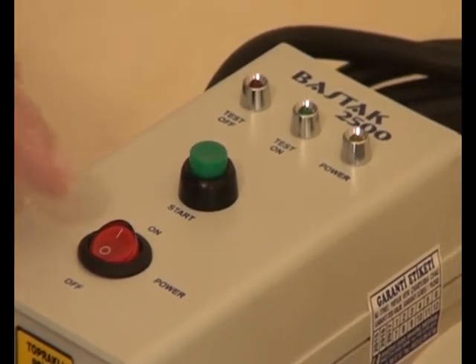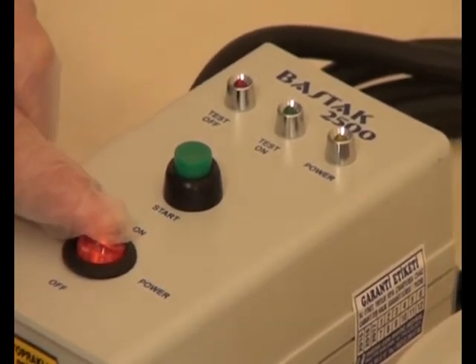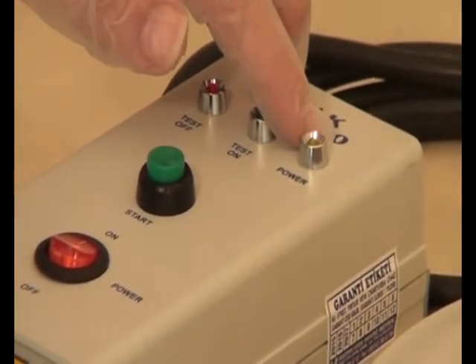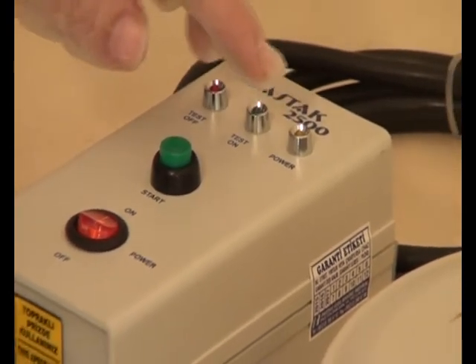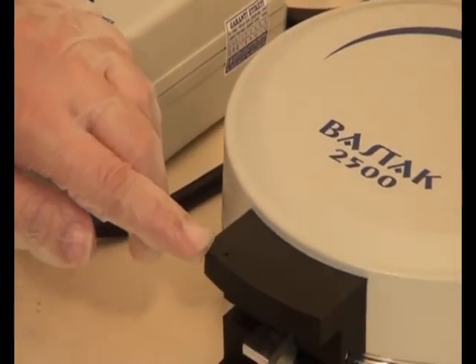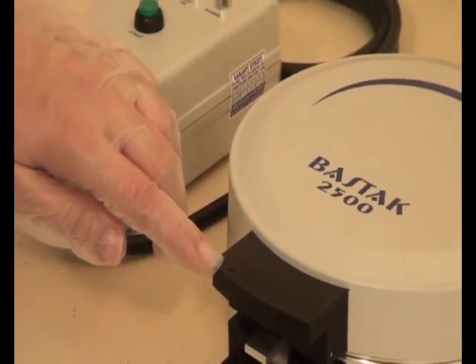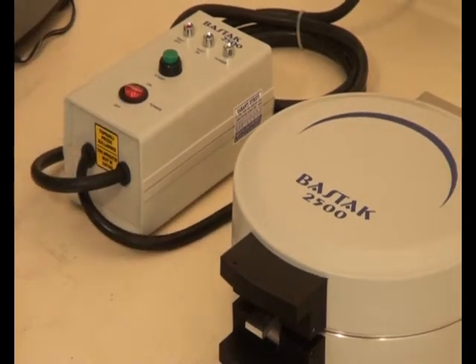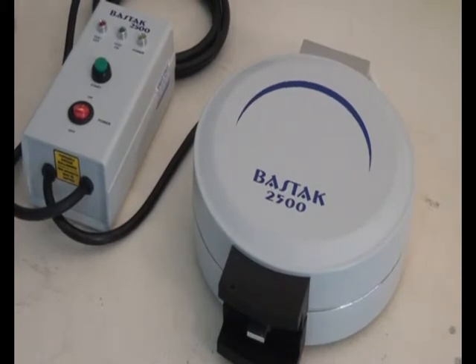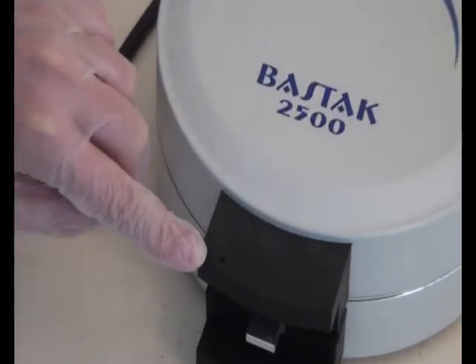The working principles of the Bastak 2500 model dry gluten instrument are as follows: turn on the instrument and the power indicator lamp will turn on. At the same time, the thermostat light will be on as well. When the instrument reaches 150 degrees Celsius, the thermostat light will turn off, indicating the instrument is ready for testing.